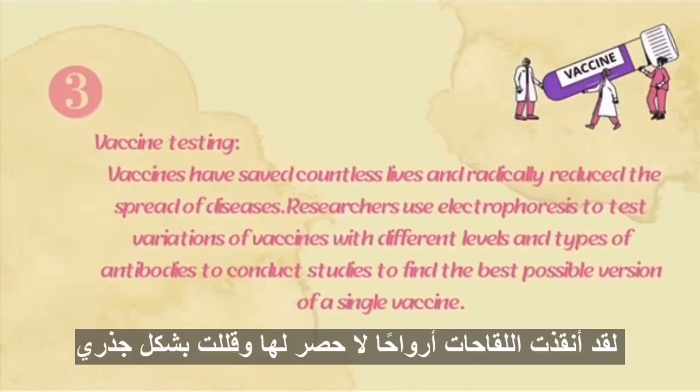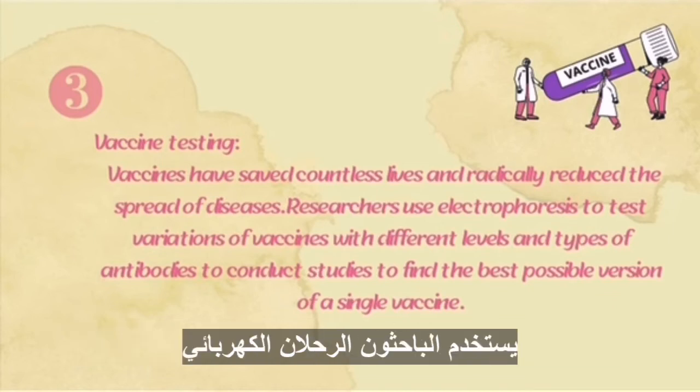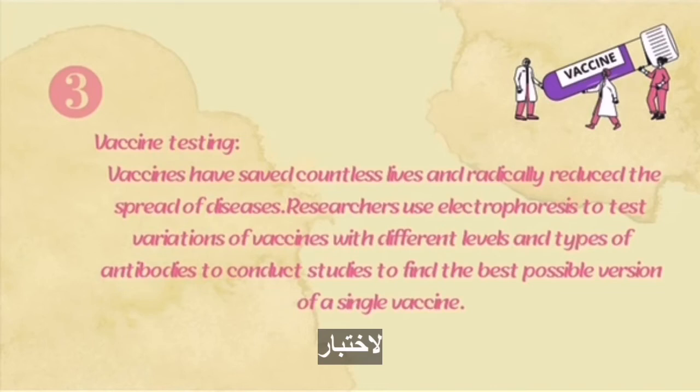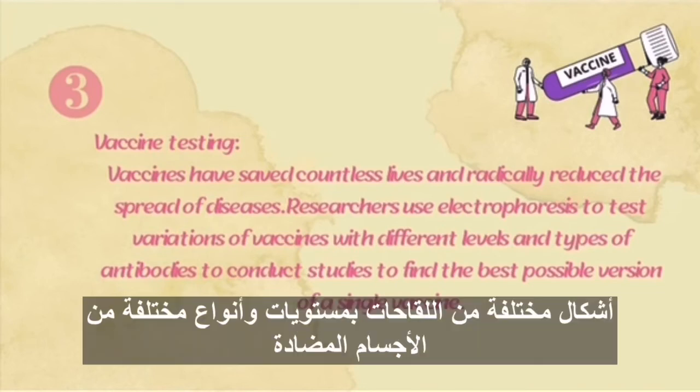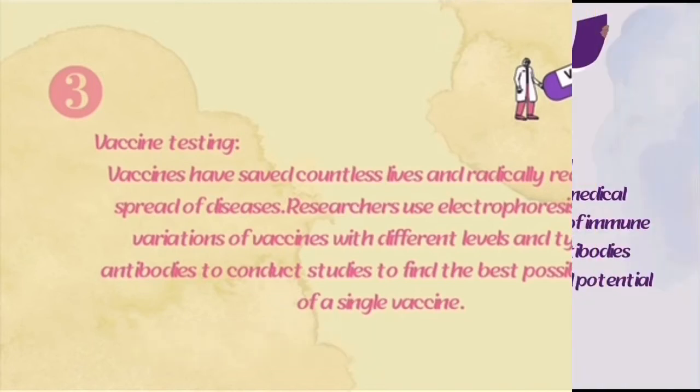Vaccine testing. Vaccines have saved countless lives and radically reduced the spread of diseases. Researchers use electrophoresis to test variations of vaccines with different levels and types of antibodies to conduct studies to find the best possible version of a single vaccine.